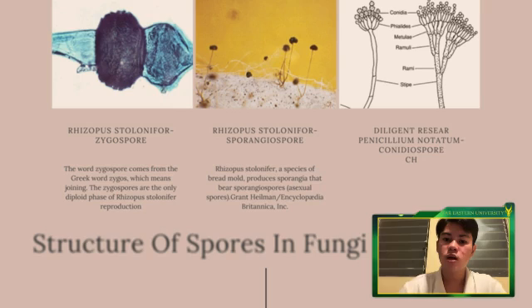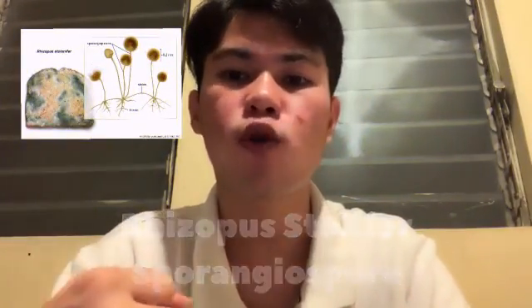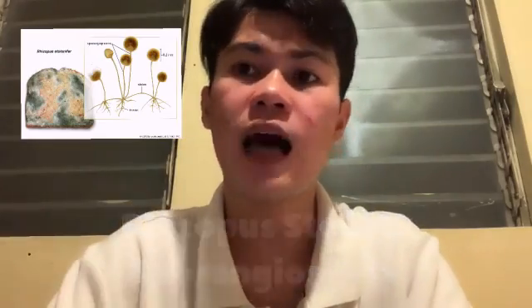They are composed of two suspensor cells, which are the former hyphae. There is a suspensor cell on either side of a large rough dark brown spore. The suspensor cells are present to provide support. The zygospore forms from two special haploid hyphae of opposite mating types that, due to hormones, are in close proximity to each other. In asexual reproduction, special upright hyphae called sporangiophores produce sporangia that form in an upright fashion.